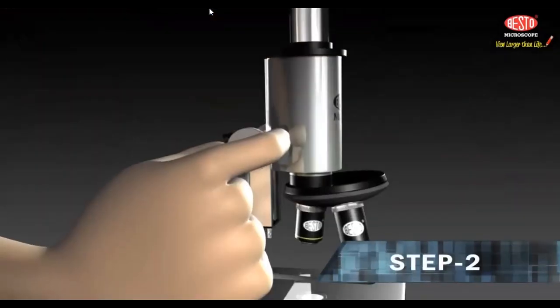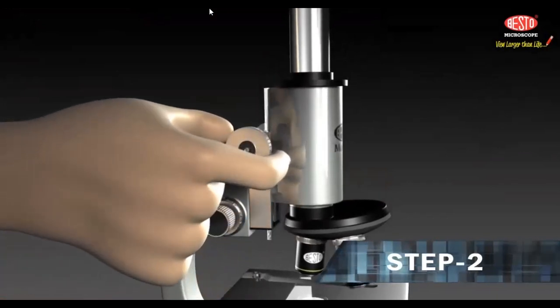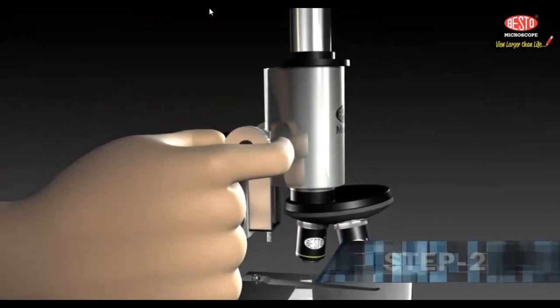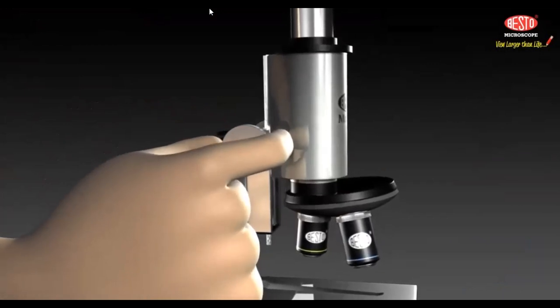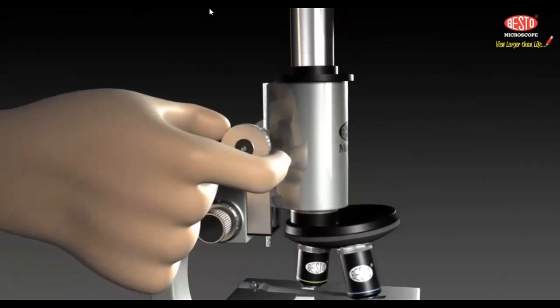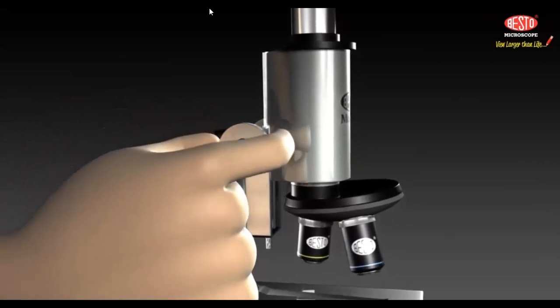Step 2. Make sure the low power objective is in place over the hole in the stage. Use the coarse adjustment knob to raise the objective so that its lowest end is about 1 inch, 2.5 centimeters, above the stage. In all Besto microscopes, aperture control is by iris diaphragm. At this stage, open it fully.